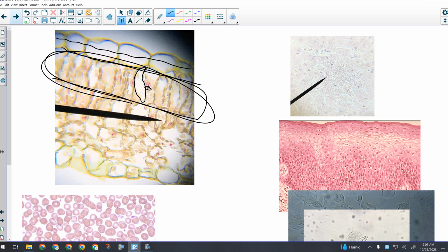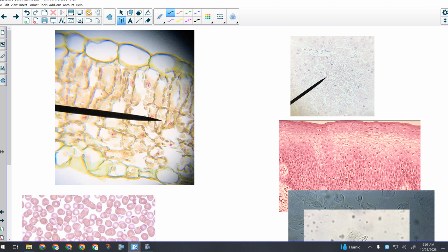I'm going to remove that circle so now you know where to look. You can see it looks a little bit different at the bottom. If this nucleus was a face, that's why I actually picked this one, there's like the eyes and the nose, and then there's the beard underneath. So I'm not saying use your imagination when you're labeling, but use your imagination when you're labeling.